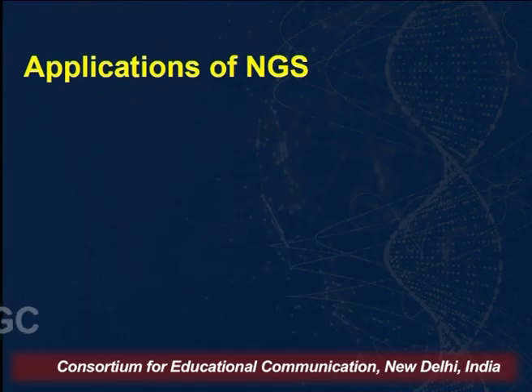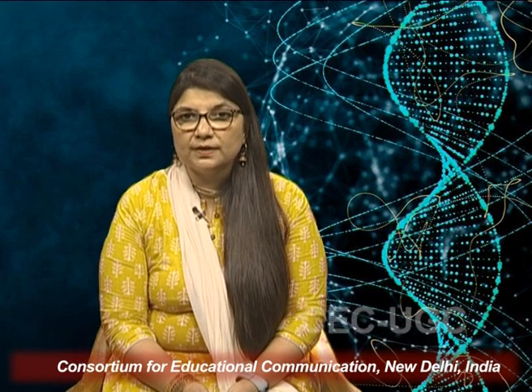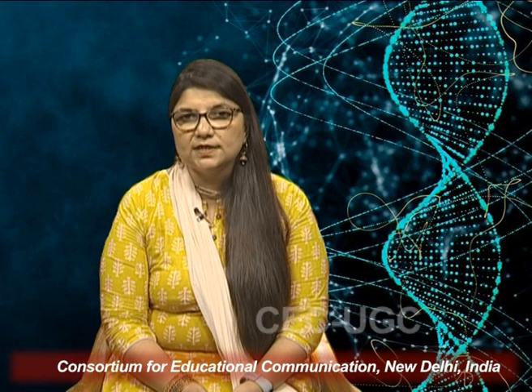Now let's look at the last part, the applications of NGS. NGS allows research labs to rapidly sequence whole genomes. As I said, the first human genome took 13 years to be sequenced and cost a very high amount of dollars.